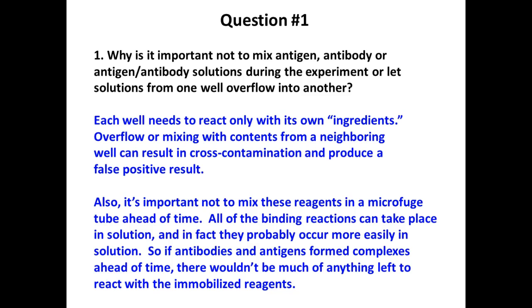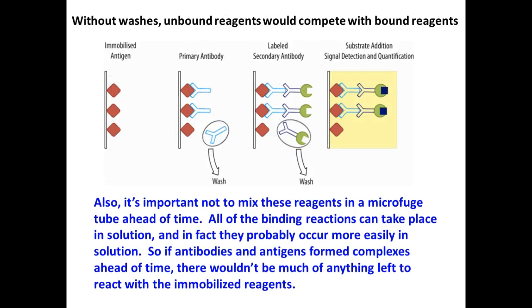We want these reactions to be happening separately. So, without washes, these things would stick around that aren't binding, and they would compete with the other stuff that we're adding. And it also would create these reactions in the tubes ahead of time. We want it only happening on our immobilized surface.